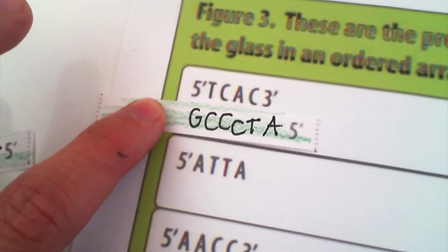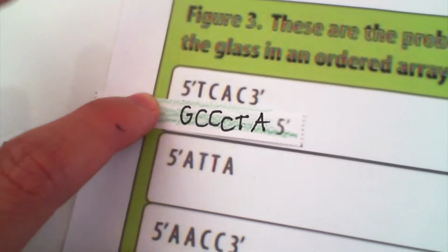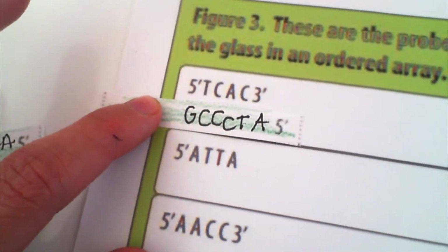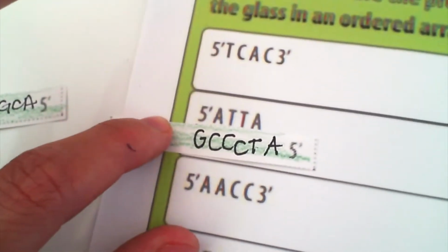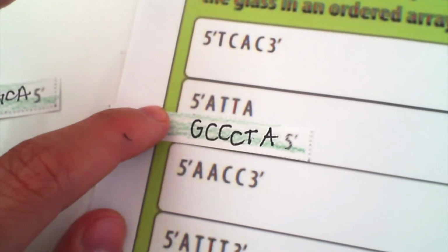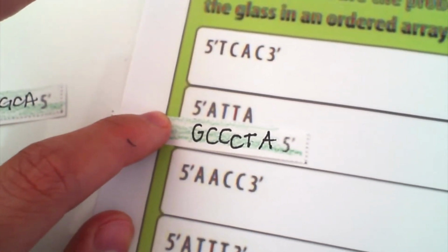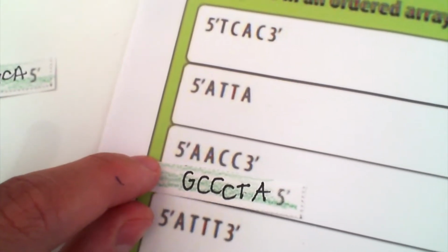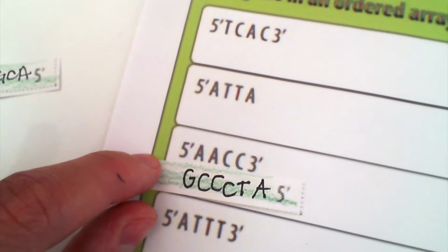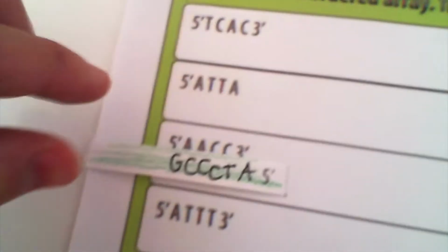If you said no, that is correct. This one is not going to stick to this gene. But it doesn't mean it's not going to stick to the other one. So you have to go through all the rest of the genes. Would this one stick? The answer is no. Going down to gene 3, would this one stick at all perhaps? No. Okay, so I'm going to finish that one off.